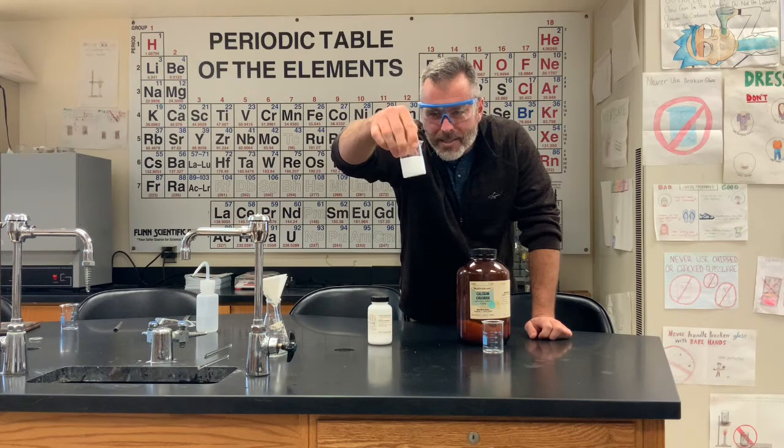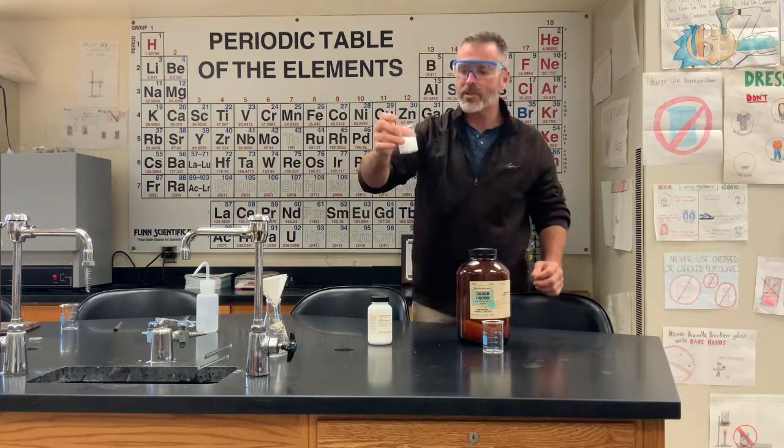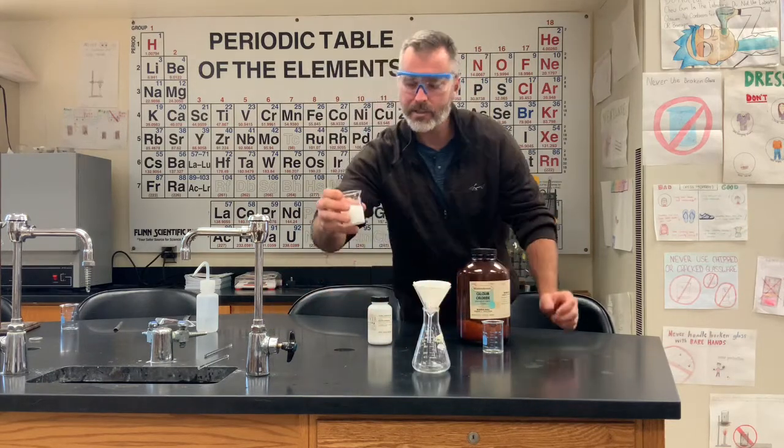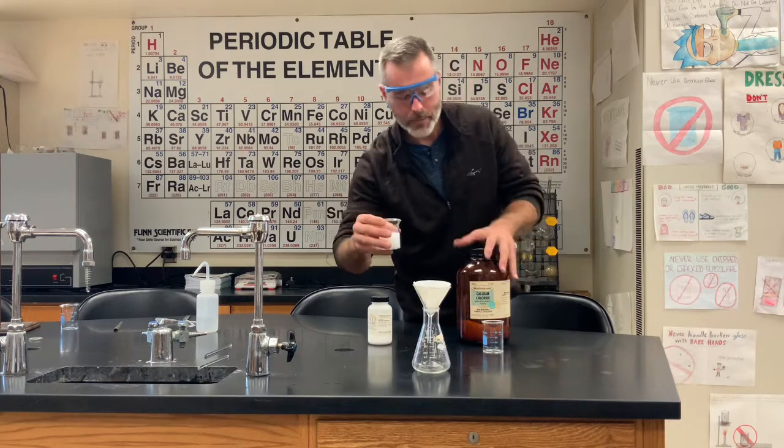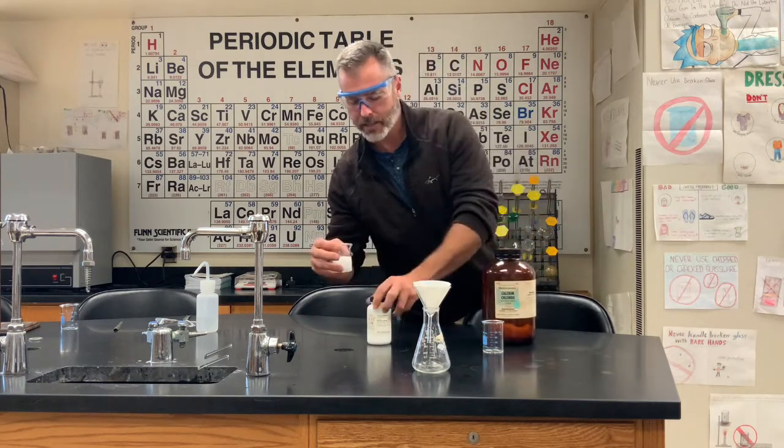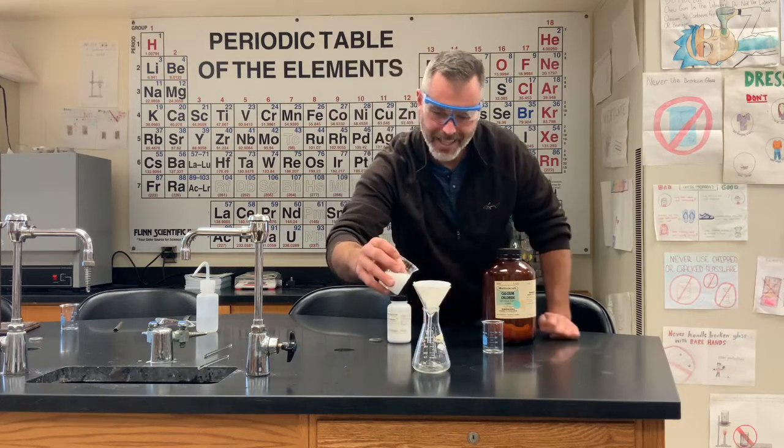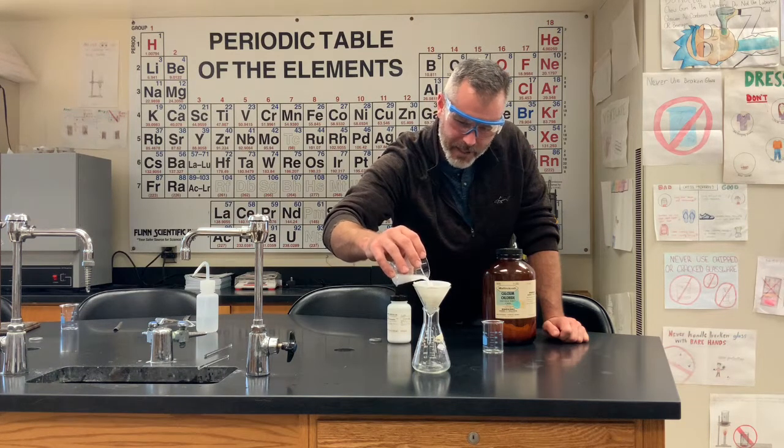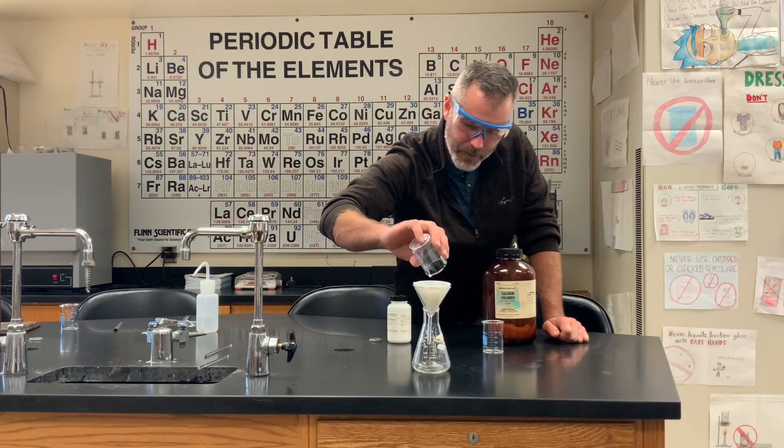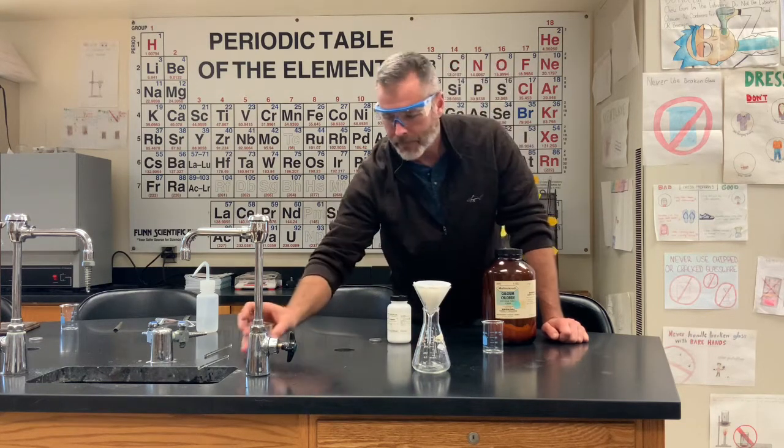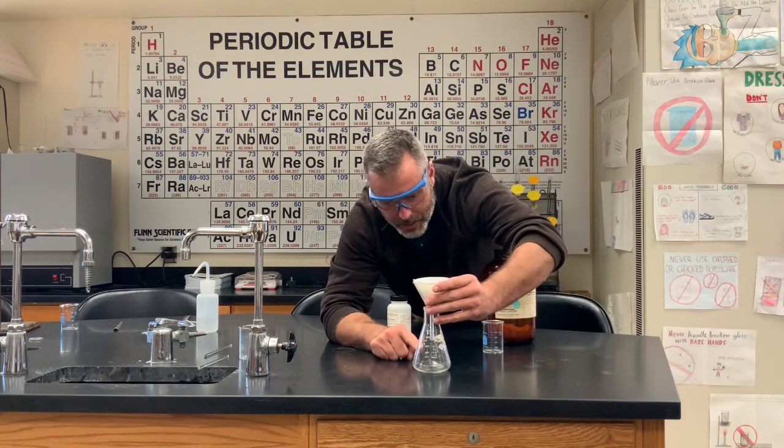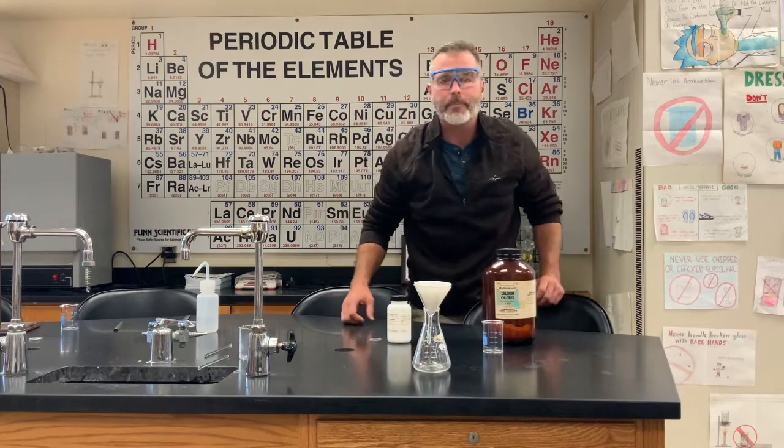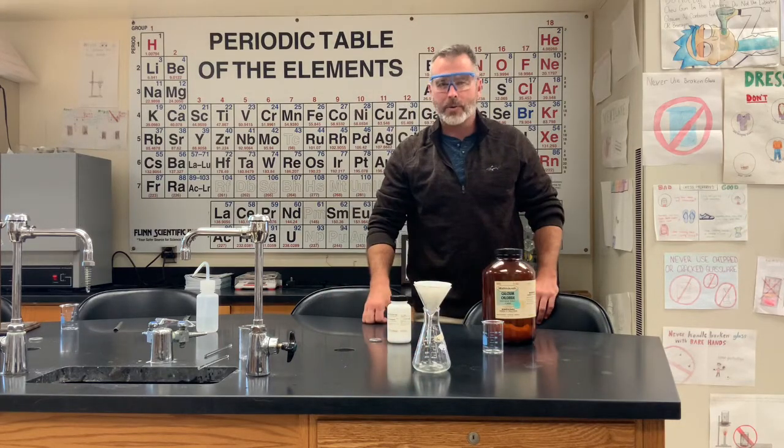All right, but you can see a white substance in there. I mean, it's really white. So now what I'm going to do here is take our funnel, and we're going to filter this out. We're going to show you the product. Remember, it was calcium chloride combining with sodium carbonate in a double displacement reaction. The thick, white, cloudy stuff is sticking behind in the filter paper, and as it's dripping through here, it is crystal clear. So our funnel, our filter is doing its job. Again, when it's done filtering out, we'll come back and we'll show you the product.